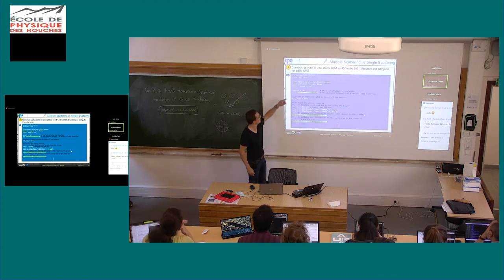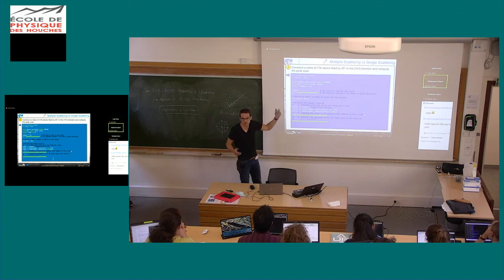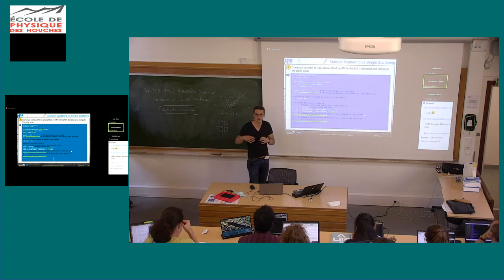So here is the body of the script. I chose to use some global variables: which kind of chain I am looking for, for example nickel, but you could choose anything else, and what is the distance between 2 nickel atoms in the 101 direction, because I will look in that direction.